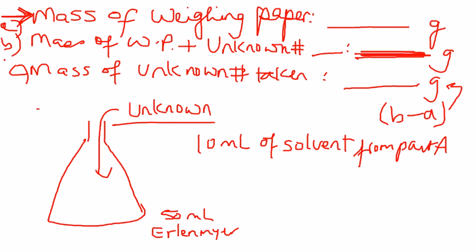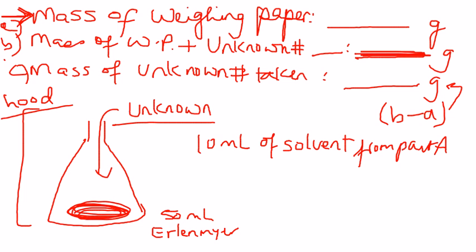We are going to do, by the way, everything in the hood, because we don't want to inhale any vapors. So we are going to do everything in the hood. So as you heat it, you should see that a lot of the solid starts to go in, and it should completely dissolve, or at least some amount should get reduced.